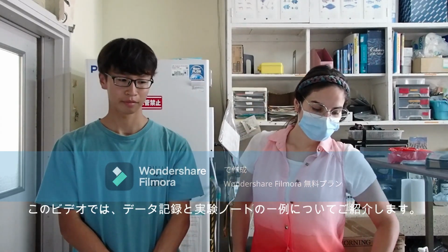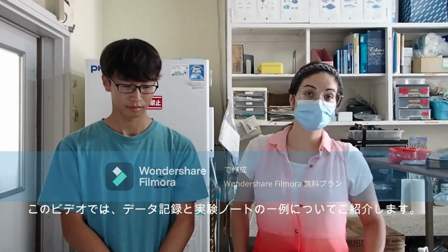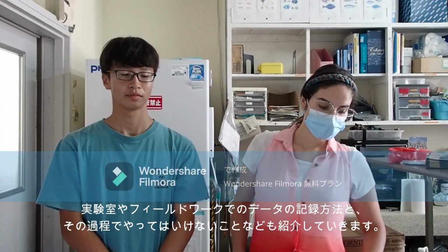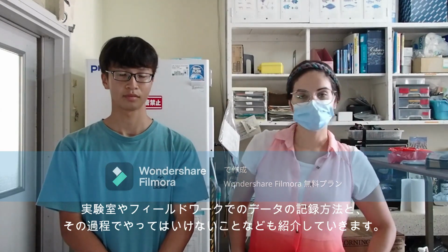So in this video we will introduce you to the topic of data recording and experiment notebook best practices. We will give you some suggestions on how to record data in the lab and during fieldwork, and what is suggested to do and don't during the process.